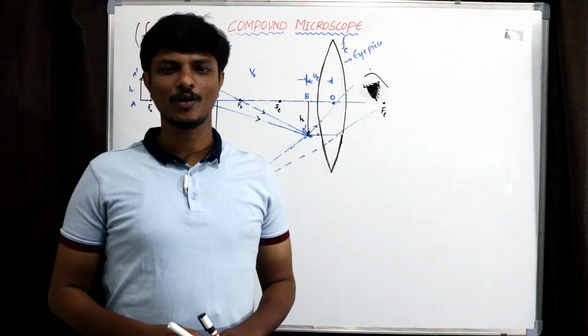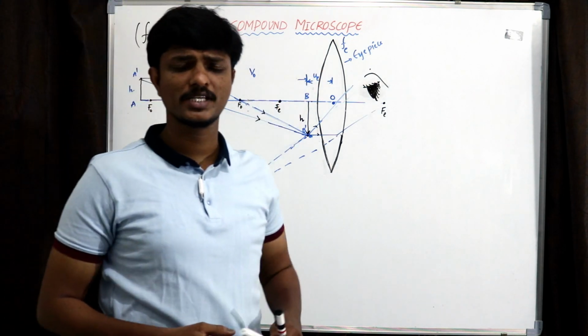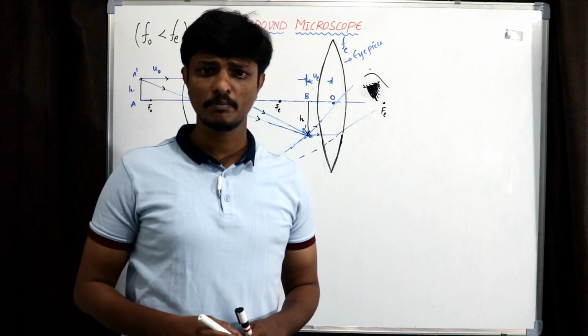I have come up with another topic called compound microscope. In the previous lecture, I have explained about simple microscope.